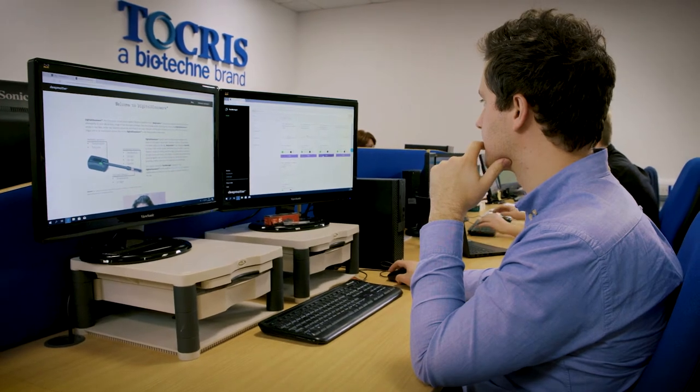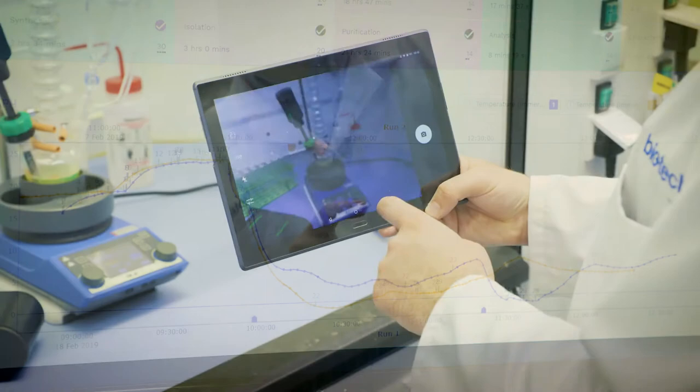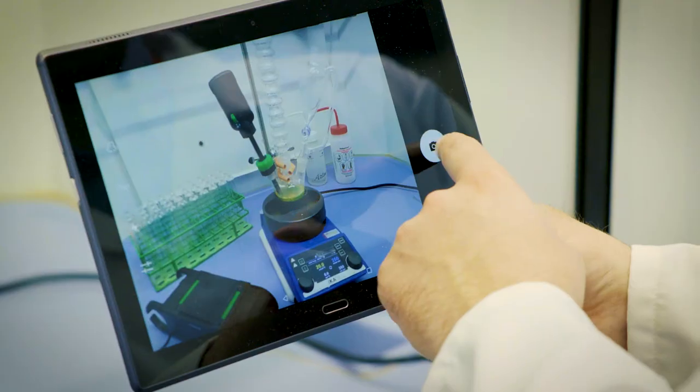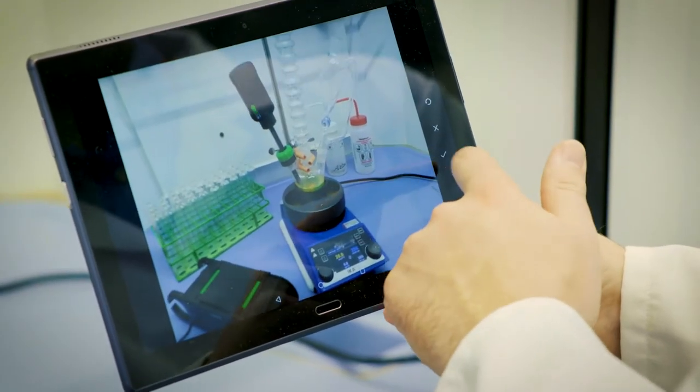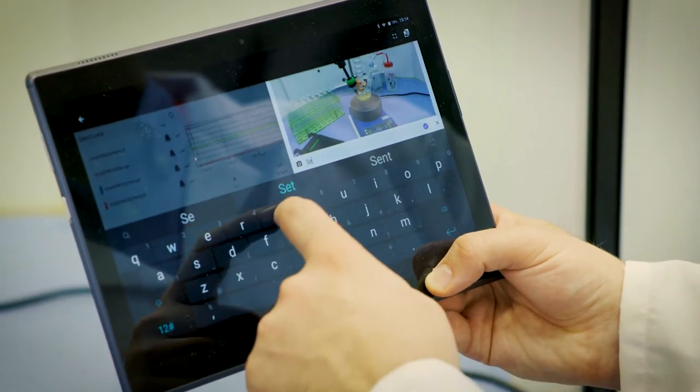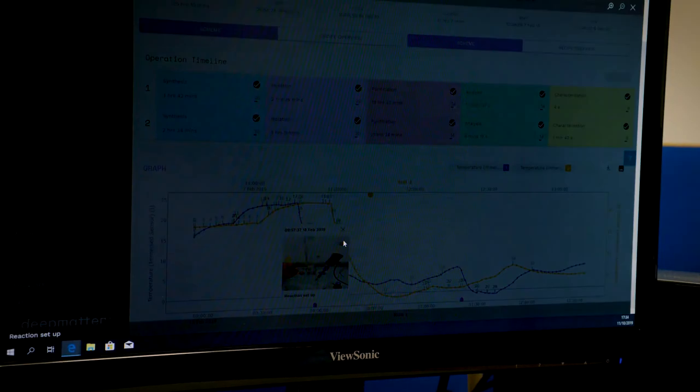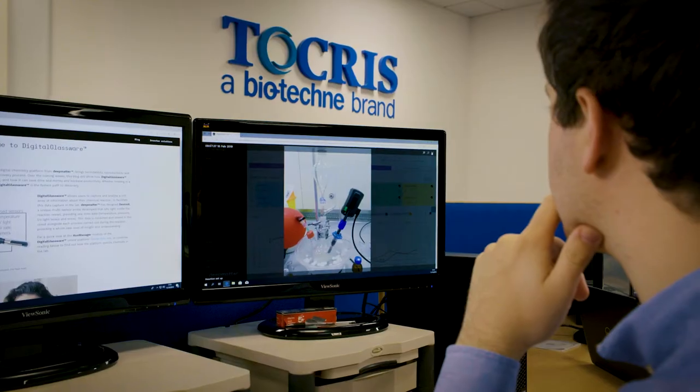With a traditional thermometer we're unable to review the data at a later point. The photo notes was something that we asked for as part of the Pioneer program. We found photo notes to be useful for taking pictures of experimental setups and for taking pictures of colour changes in the reaction as things progress.